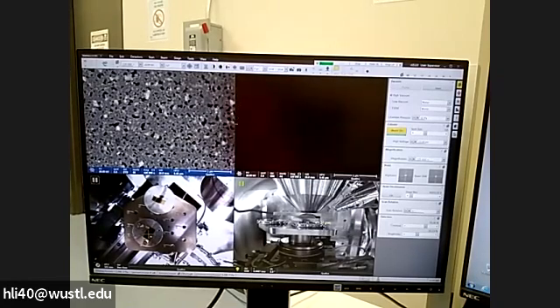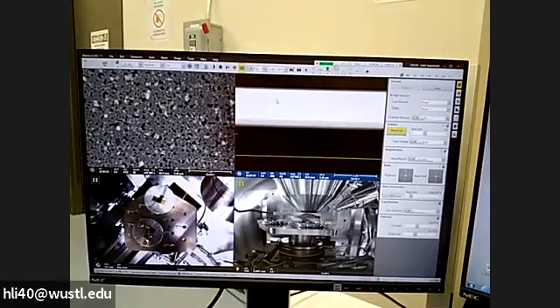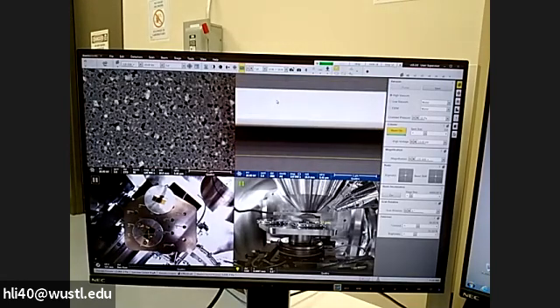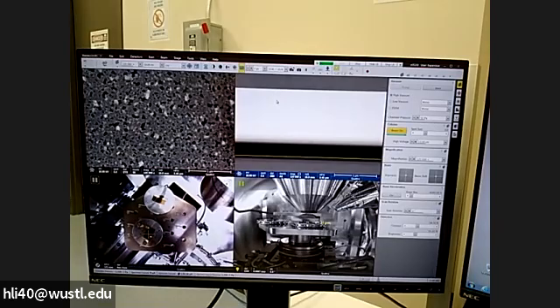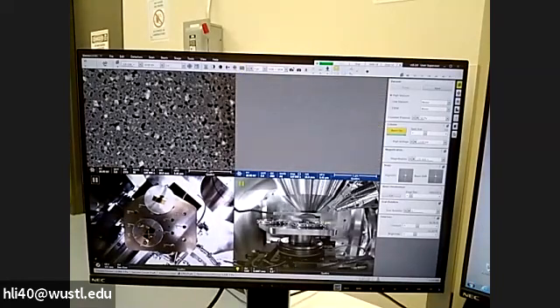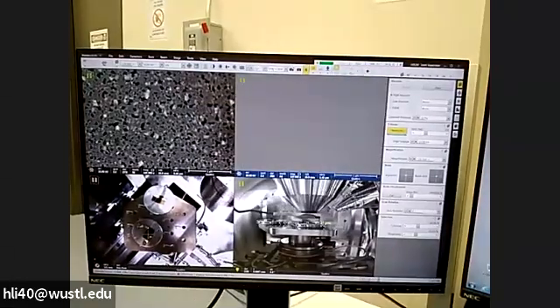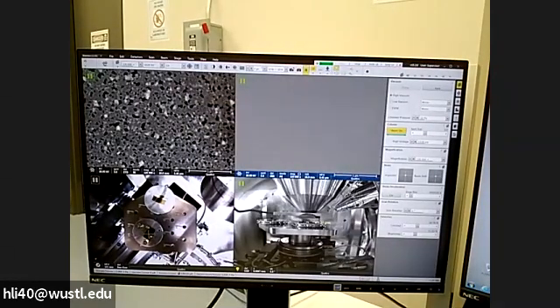So, all right, after we adjust it, we need to adjust this contrast and brightness. It's too low in brightness. So we put around here. The total signal count is too low, so that's why it's difficult to adjust. So we select the pause button if we like, or we can put integration there and pause it. Okay, then we go to File, Save All. Okay, so this is how we get the image.